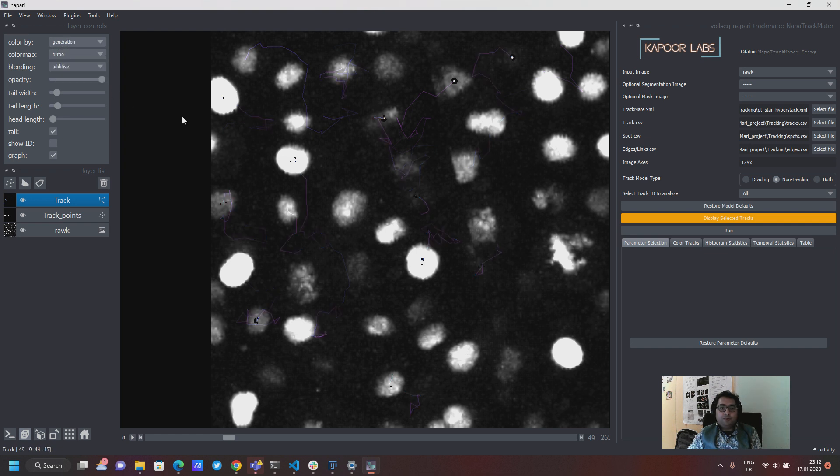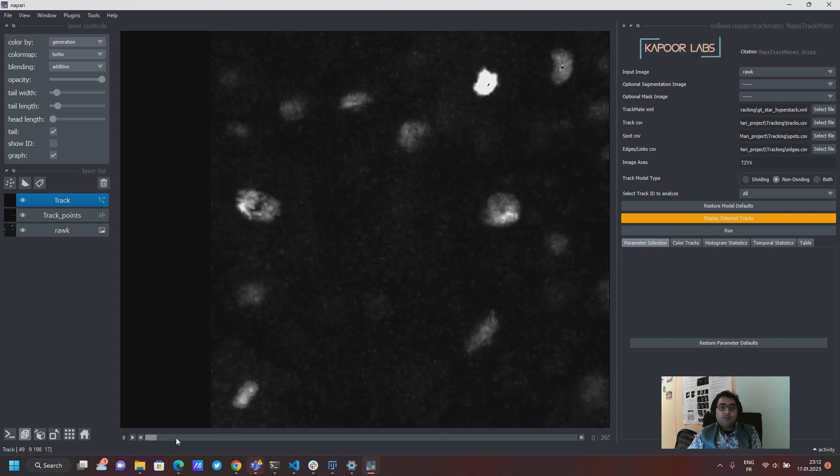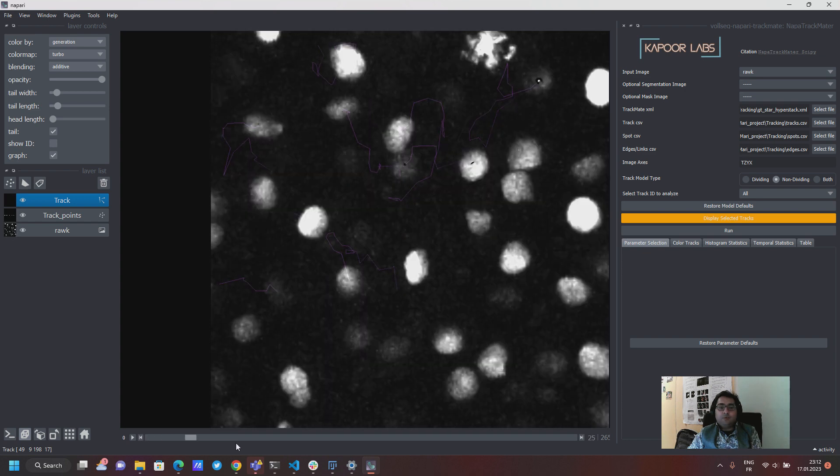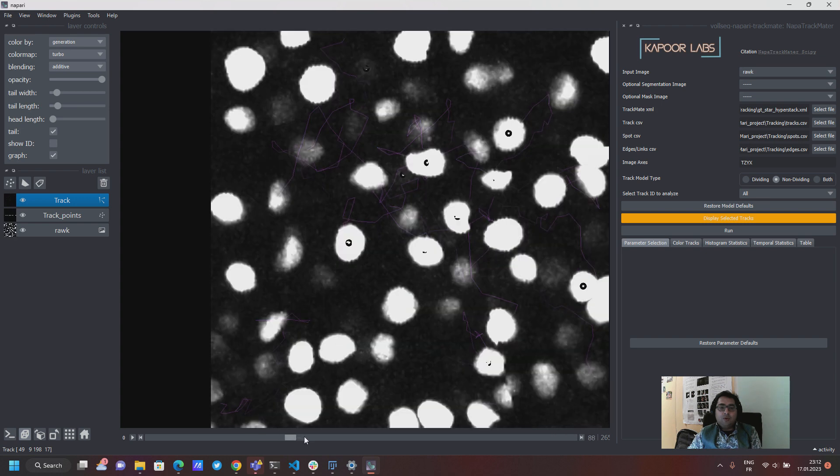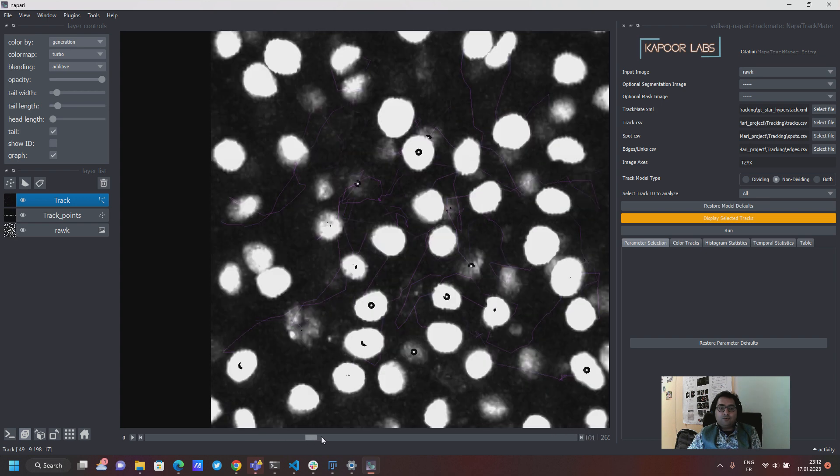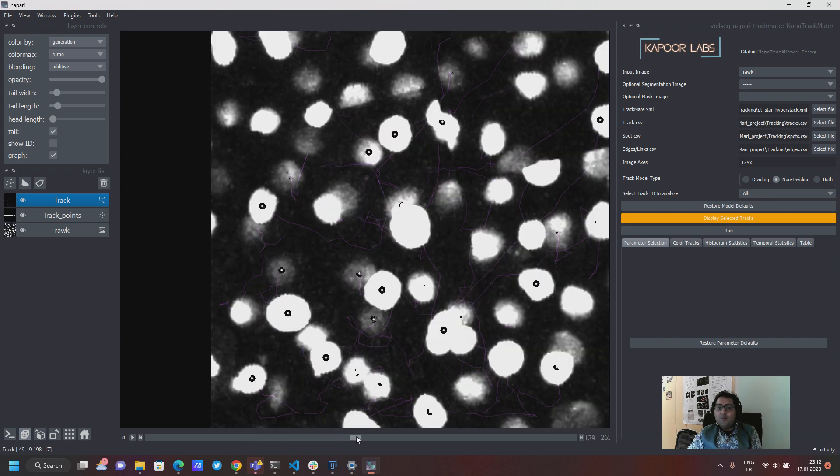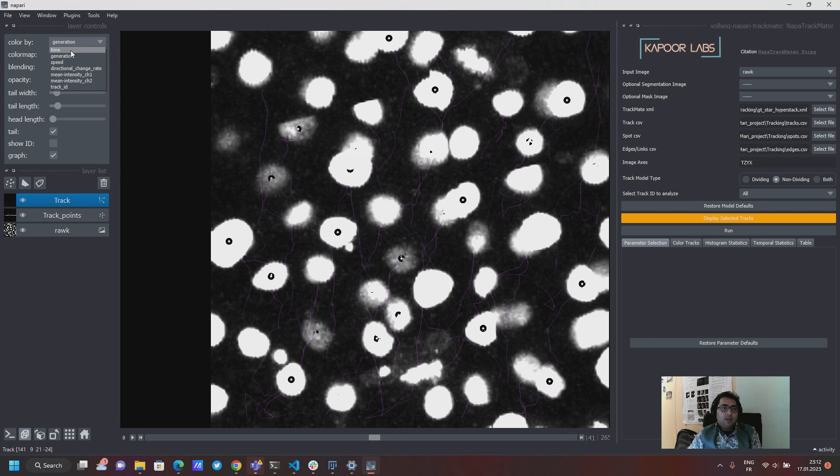Now because these are non-dividing tracks there is actually only one generation which is generation zero. So this is what you see when you actually start to scroll over the time that all of them have the same color. So it's generation zero that's what we expect. And if you don't like it you can see it with time, all of them will have the same color because they are at the same time.